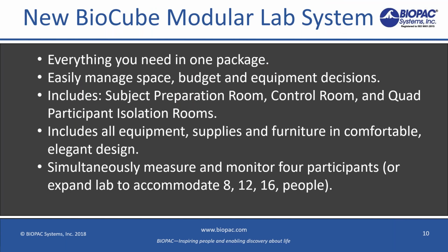The BioCube itself is basically everything you need in one container. So you get all the wiring harnesses for your data collection, the video cameras, the monitors, the furniture. If you've already got your recording system, we can wire in existing recording platforms. If you're starting from ground zero and you need everything, we can provide the recording systems as well as the infrastructure for running the lab.